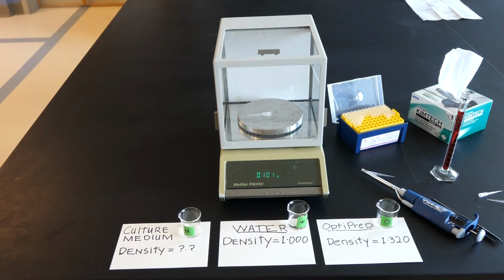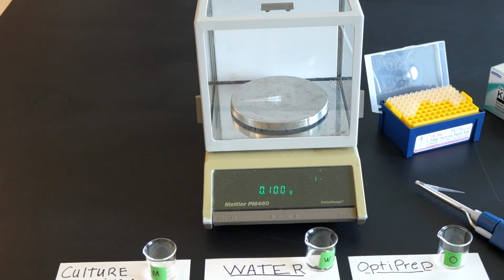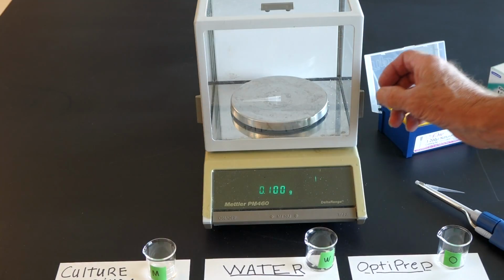That gives me the weight of the liquid inside the micropipette tip, and as you can see, it measures out at basically, if I move the decimal place one place to the right, I've got 1 gram per ml. Actually, this is 0.1 grams per 100 microliters. But just by moving the decimal place one place to the right, I get a quick measurement, and it confirms that the water that I just measured has a density of 1, which is exactly what it's supposed to be.